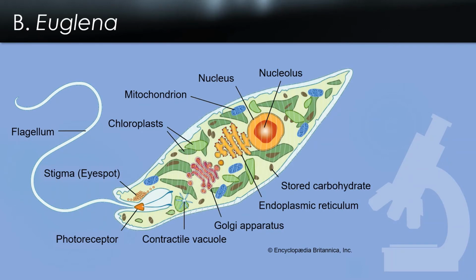Here's an artist drawing of Euglena. I'll just point out some of the structures that you're going to be looking at in the Euglena. So the nucleus, hopefully that one is obvious. It is usually the largest organelle, although not pigmented and colored. Also the chloroplasts. The chloroplasts, of course, are green. And something I'd like to point out is the eye spot.